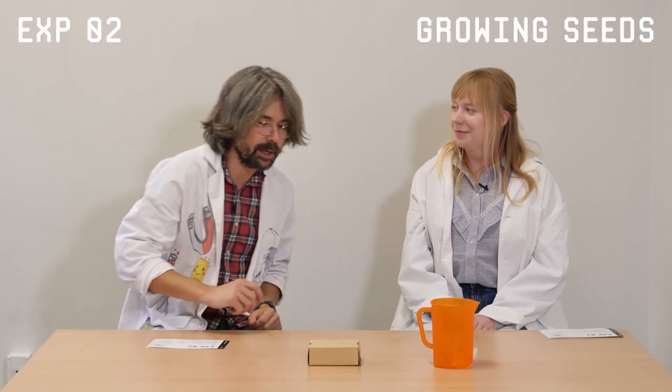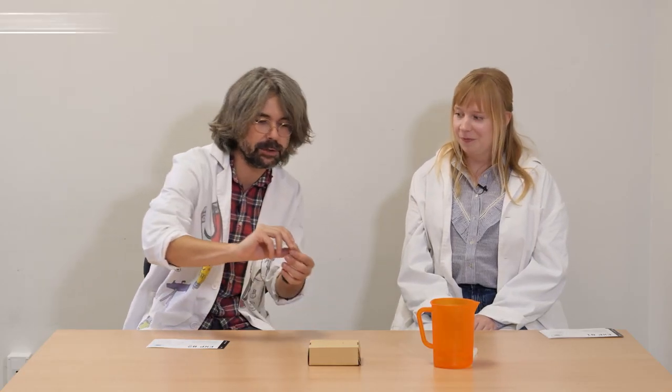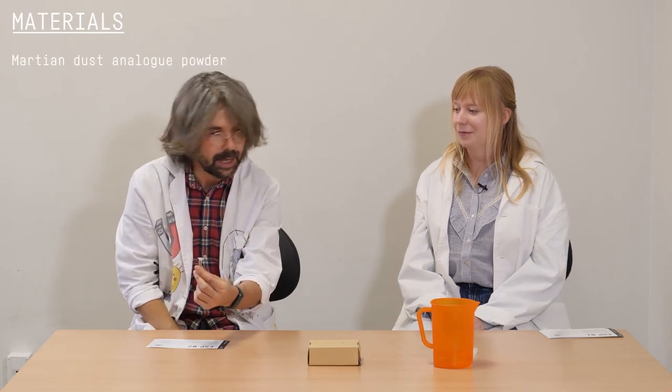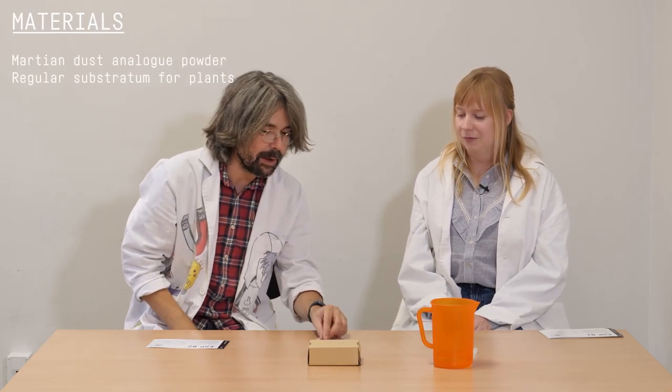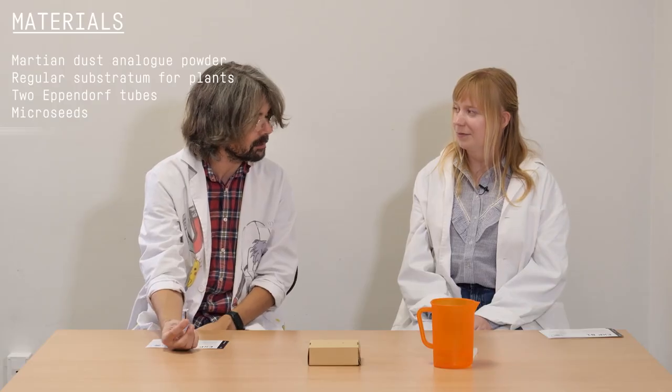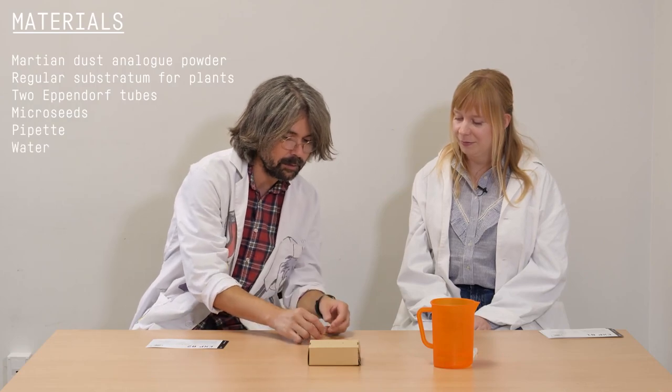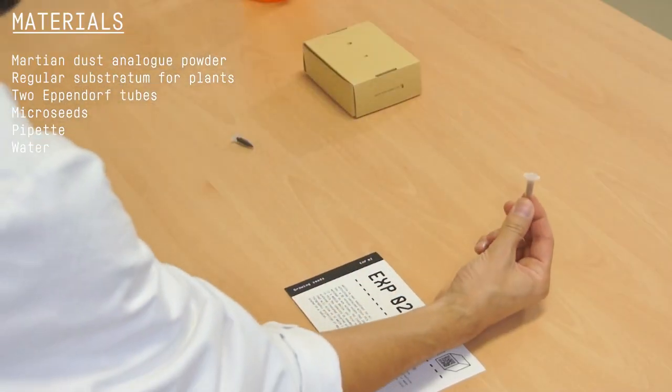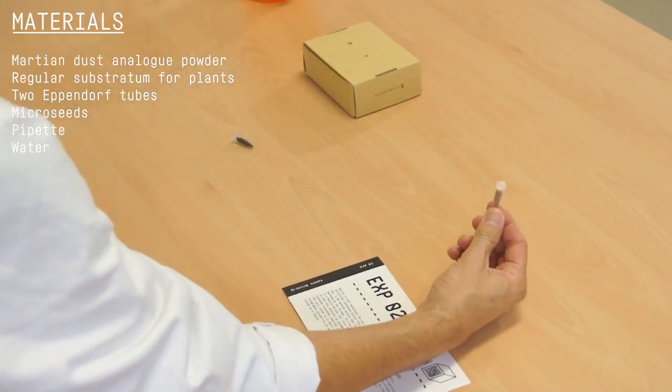For this experiment we need two small tubes. They are called Eppendorf tubes. In one of them we have some regular soil as the one in your garden, but in the other one we have some soil that is an analogue for Martian soil.